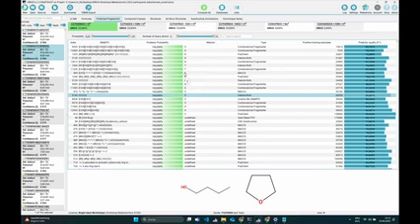And we only include molecular properties in the fingerprint of a specific CSI:FingerID version that can be predicted with a certain quality, right? So we do not insert properties where we are not able to train a predictor that has a certain quality. Does it answer your question?